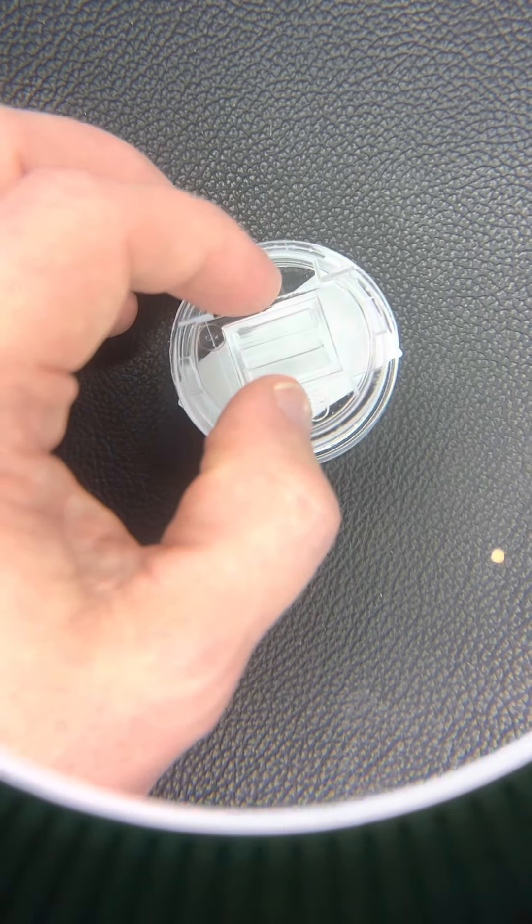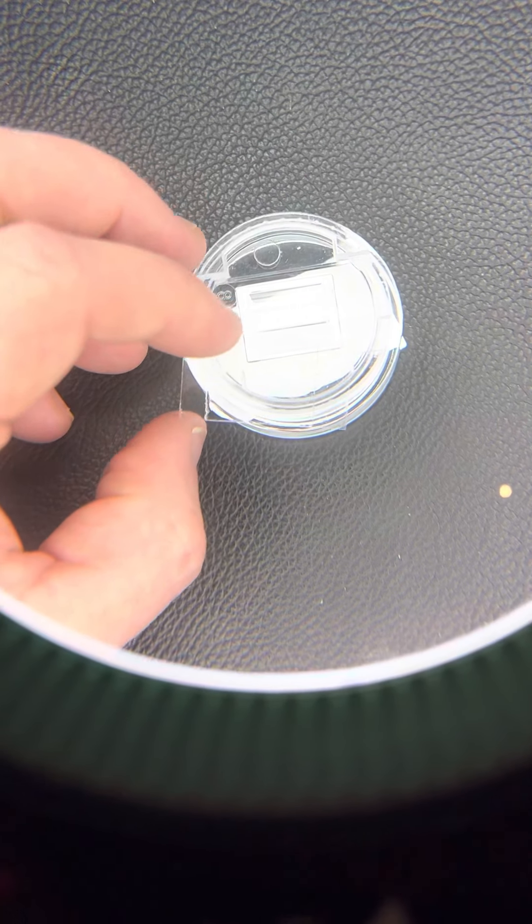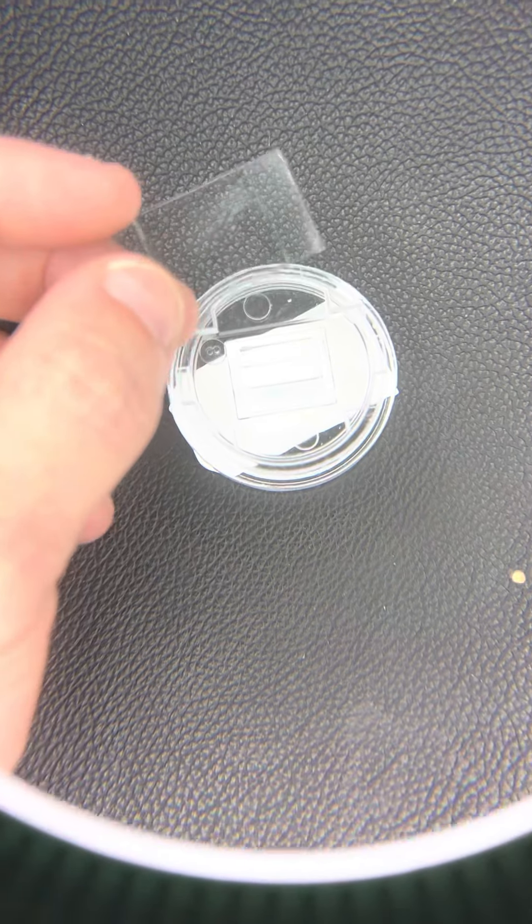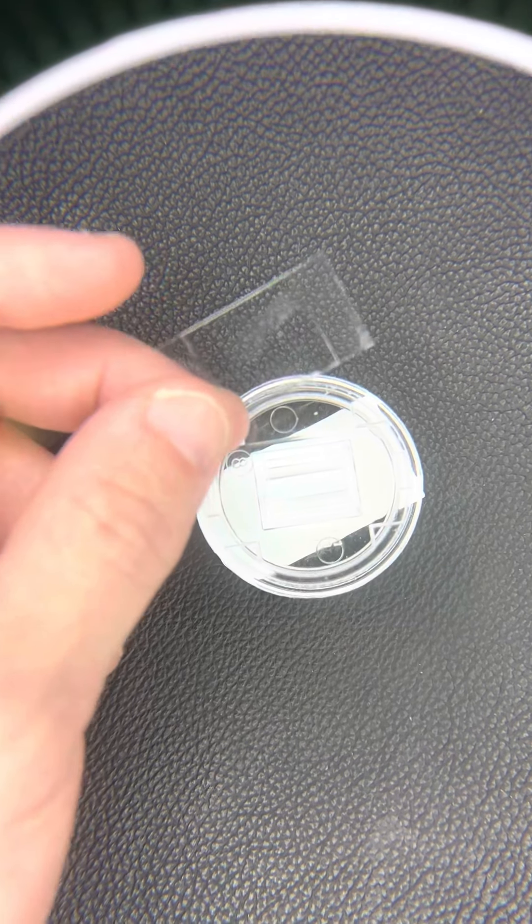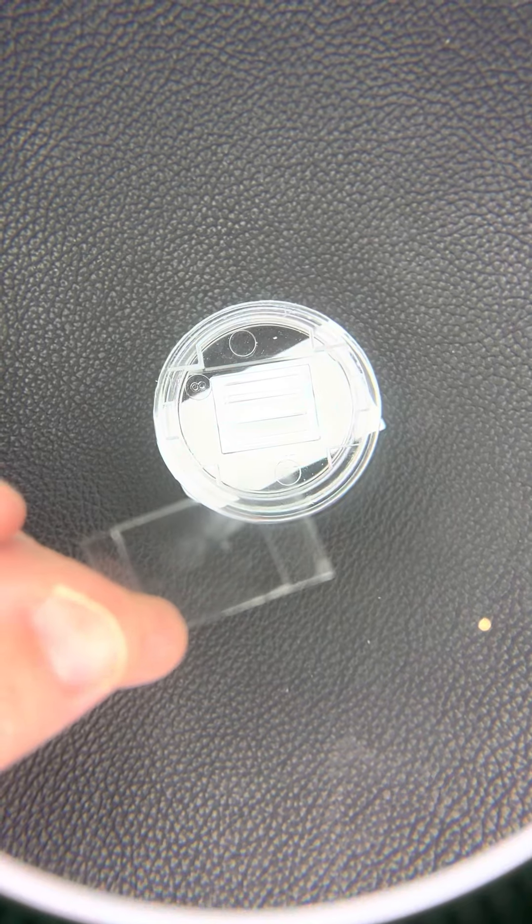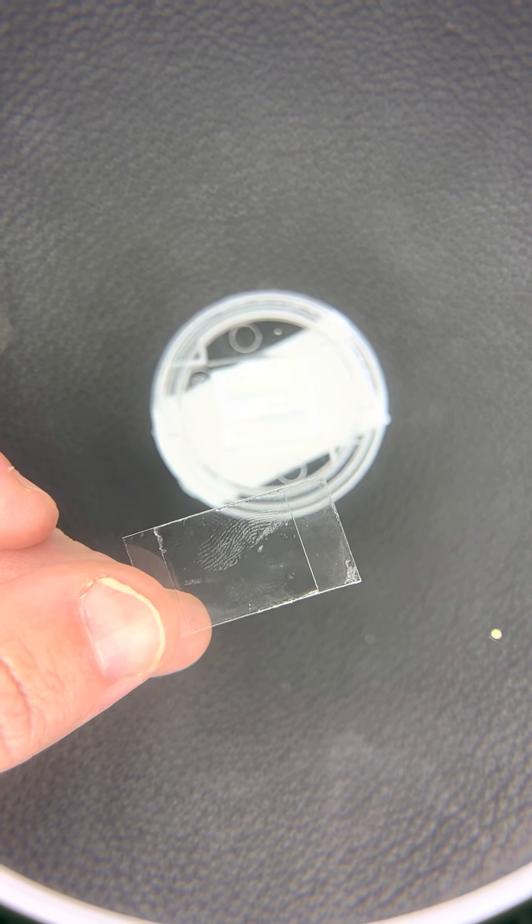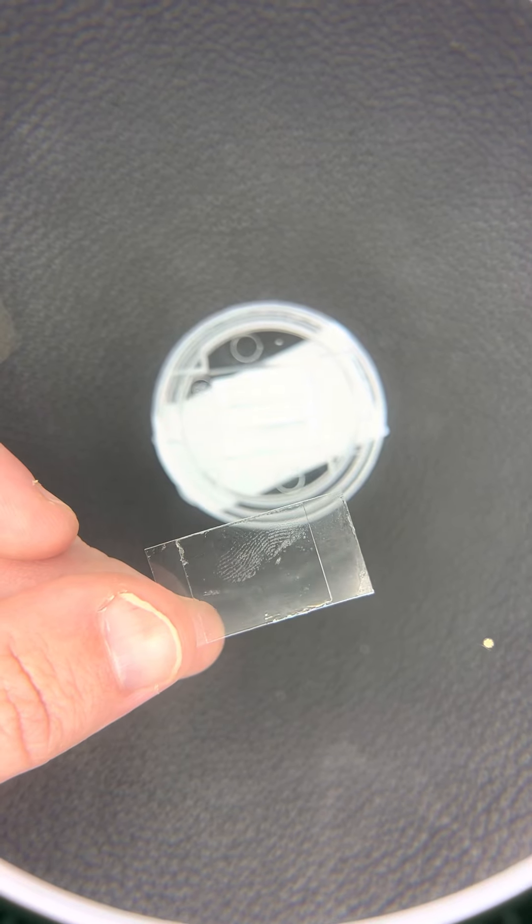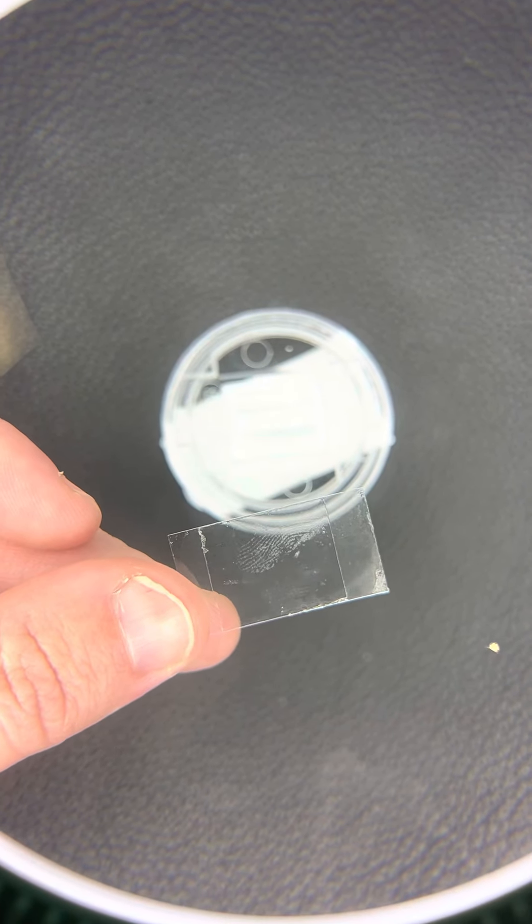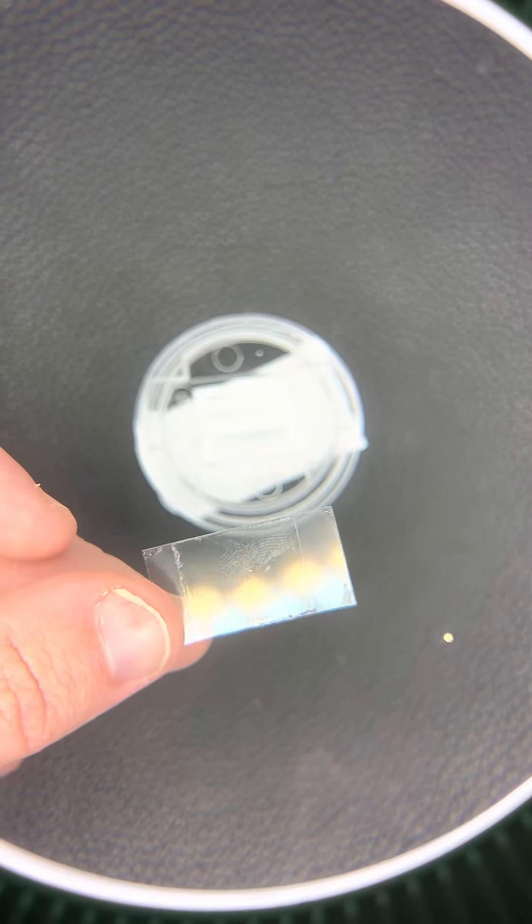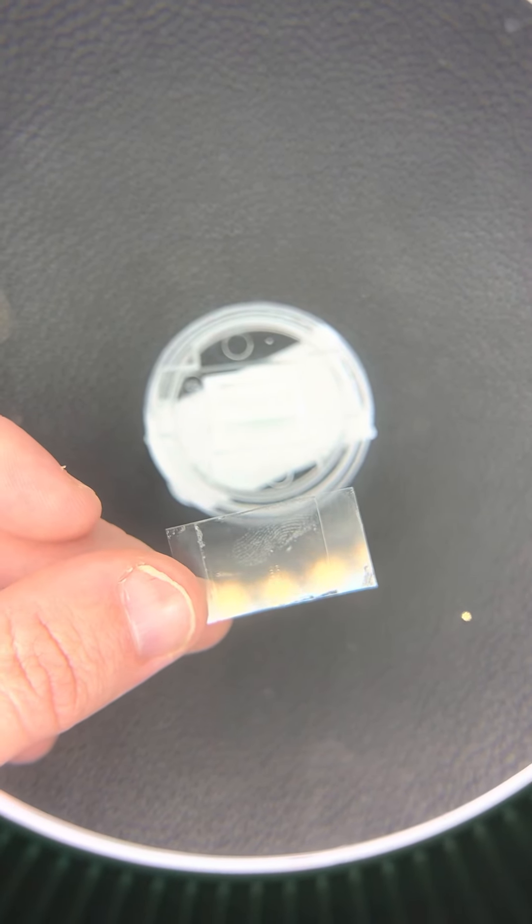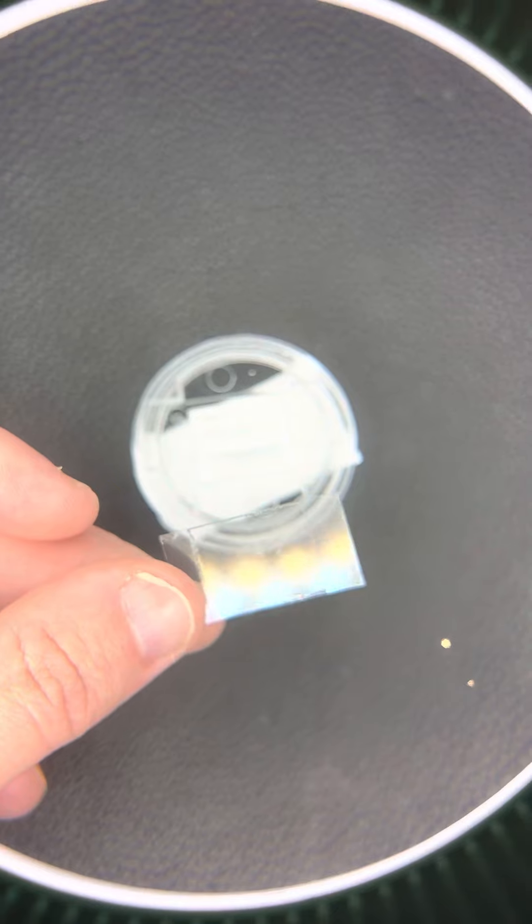This is so depressing. So I'm going to take this off and make it so that you can see this. I hope this comes out well in the video. There we go. You see that? You see how I can leave a fingerprint on that and you see how you have this perfect line of media across this.